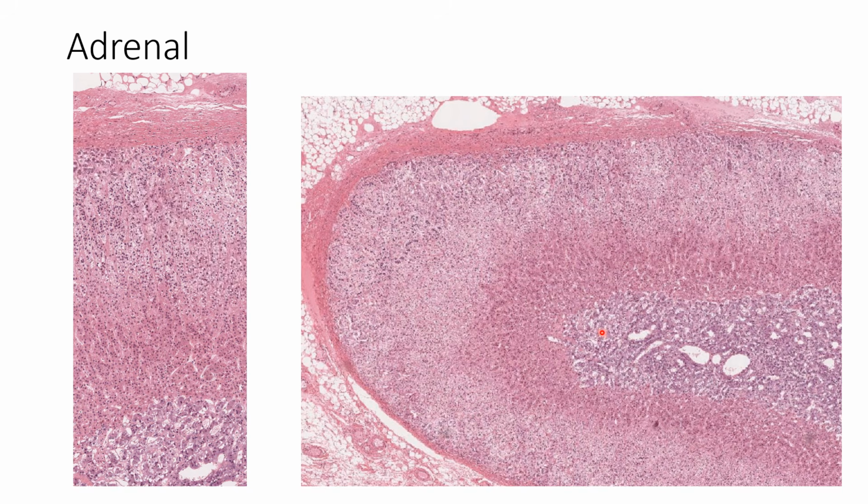So this whole thing is the adrenal medulla, that whole inner area. And then from here to there is the adrenal cortex, or if we're going this direction, from here to here is also the adrenal cortex.